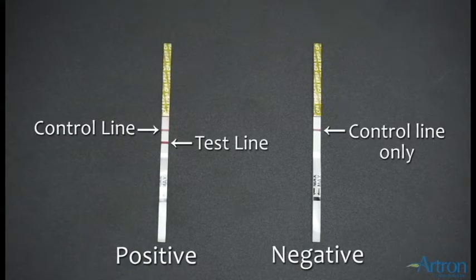The test strip on the left displays a positive result with the presence of a control line and a test line.